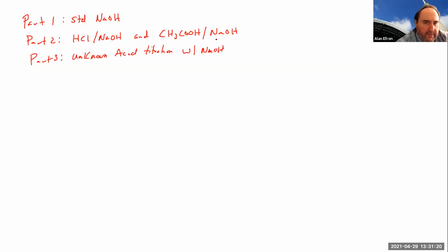So basically, you're going to be doing these titrations using that Chem Collective software that we've been using. You'll be able to take out on your workbench a burette. You'll be able to take out some sodium hydroxide, some HCl, some acetic acid, maybe not all at once, obviously. You'll get a pipette. You'll set it up just like normal. And you'll be able to add from your burette, again, by dragging it over to your flask or whatever it may be.